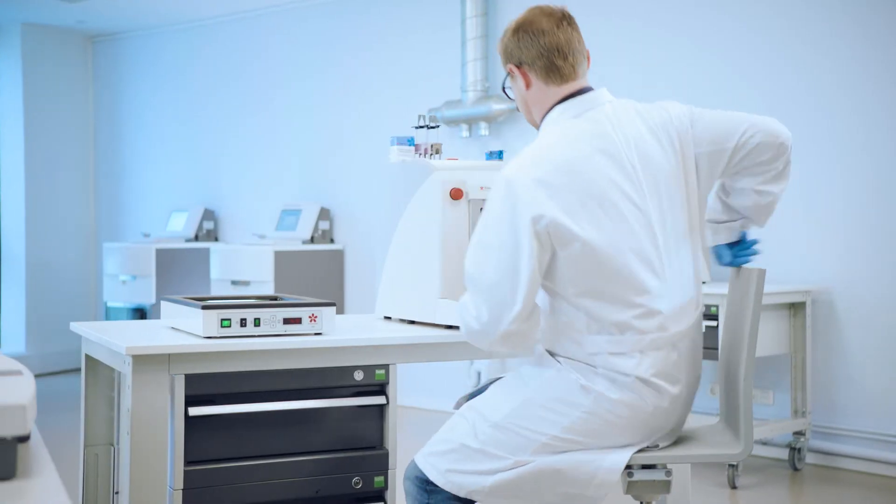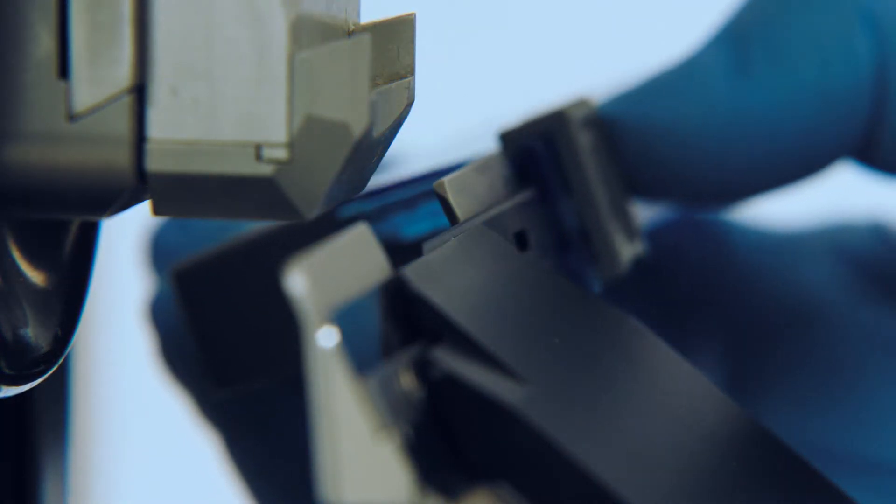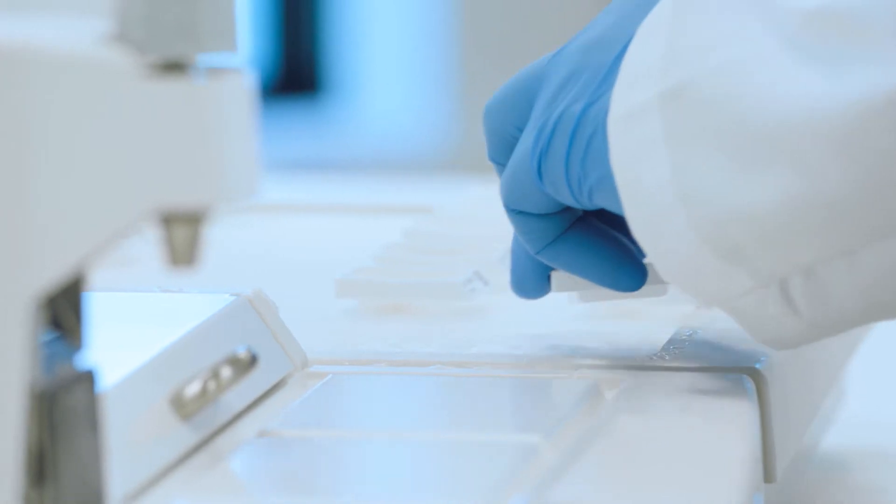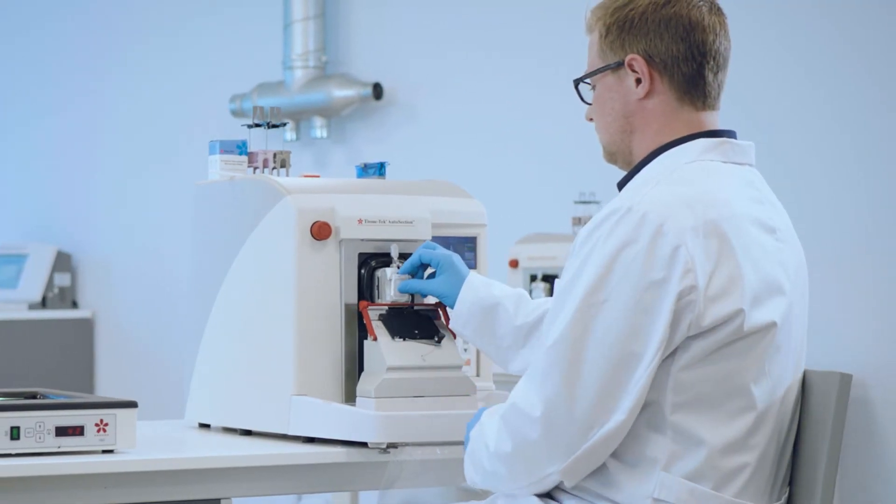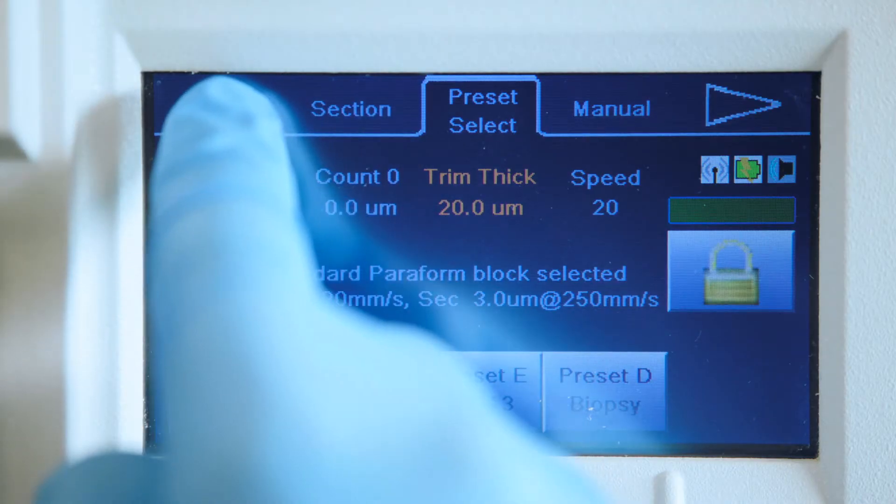Microtomy requires my full attention and dedication to make sure that I deliver the perfect slides. And with the TissueTek AutoSection, I started getting the job done easier, faster, and with better quality.